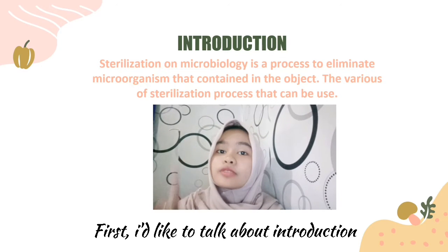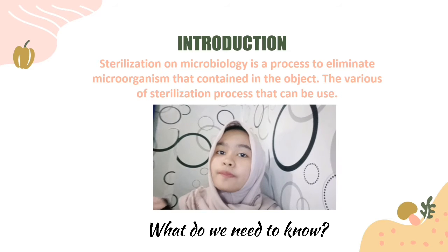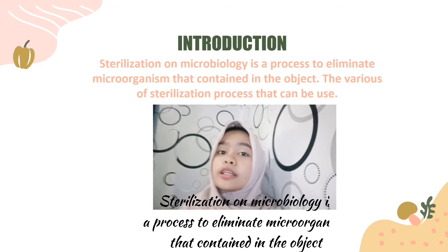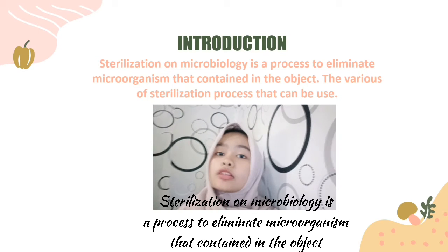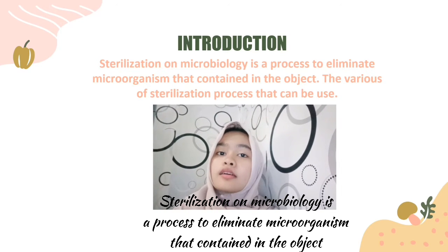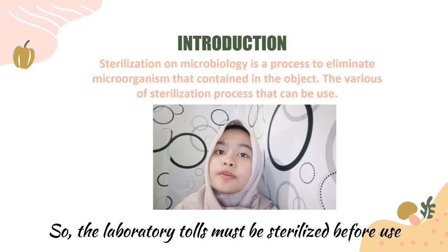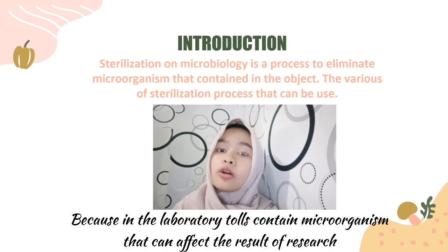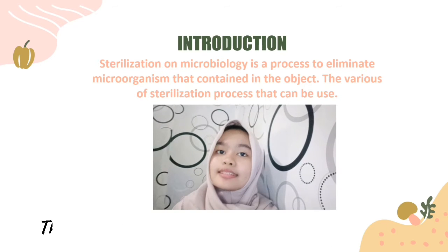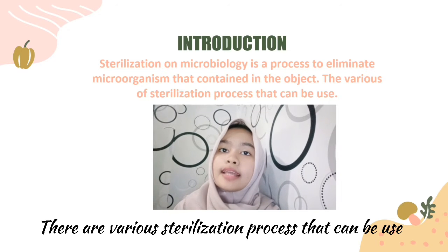First, I'd like to talk about introduction. What do we need to know? Sterilization in microbiology is a process to eliminate microorganisms that are contained in the object. So, the laboratory tools must be sterilized before use because the laboratory tools contain microorganisms that can affect the result of the research. There are various sterilization processes that can be used.